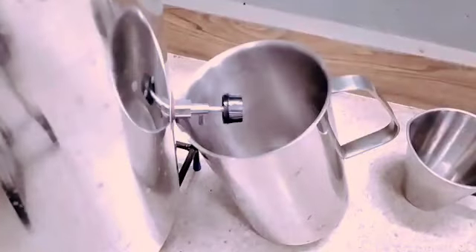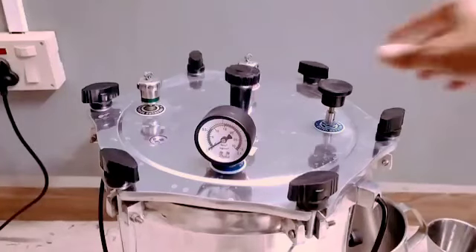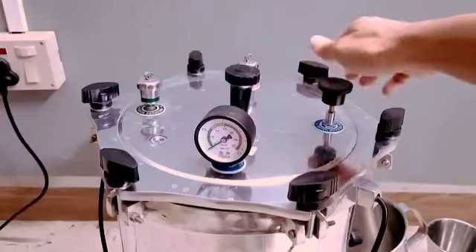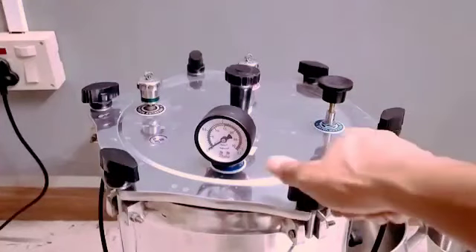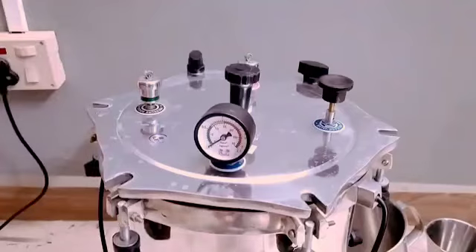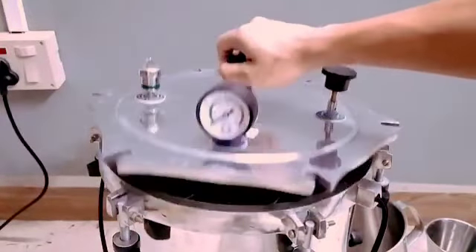After closing the vacuum valve, allow the autoclave to cool down for about an hour or so. Once it has sufficiently cooled down, open the steam release or air exhaust valve to destroy the vacuum inside the chamber. Now loosen the lid screws one by one and carefully open the autoclave lid. Remove the sterilized contents from the autoclave and place them in a clean and dry area.